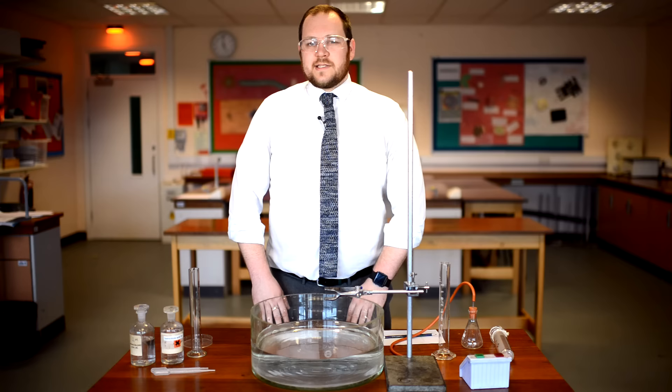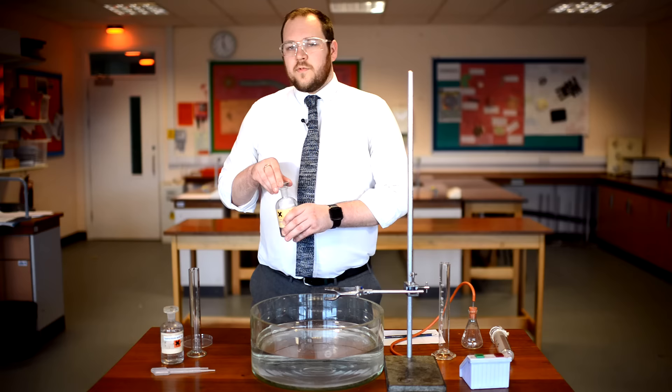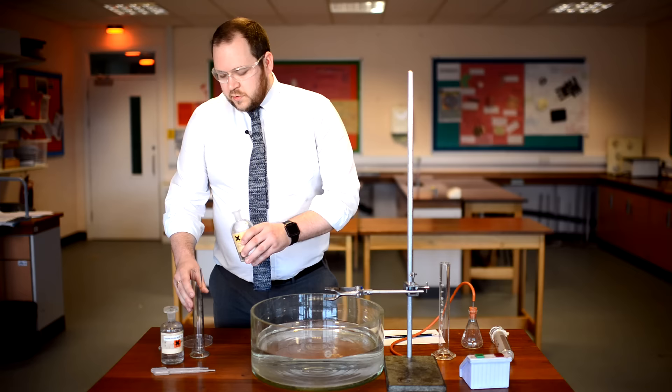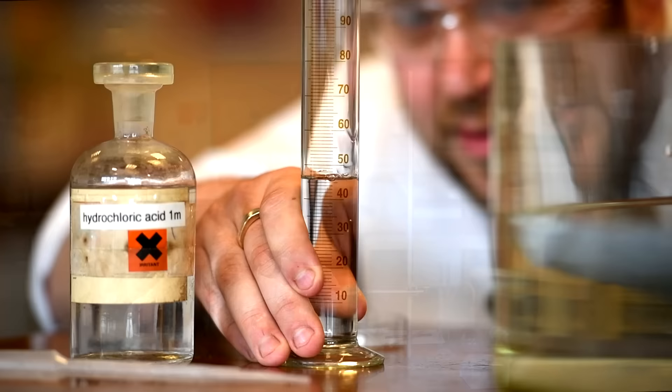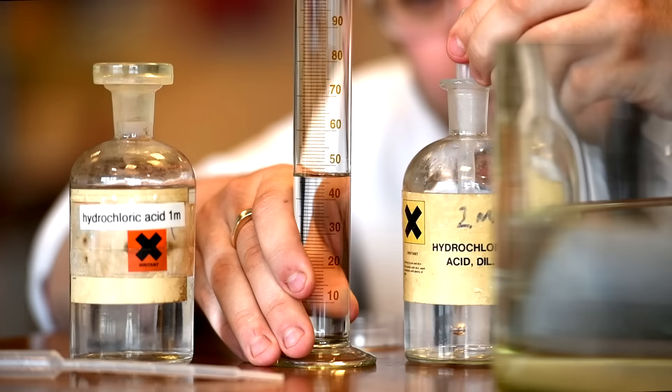I'm going to start by measuring 50 centimetres cubed of two mole per decimetre cubed hydrochloric acid in a measuring cylinder. I'm going to pour the first 45, making sure I read at eye level to see the bottom of the meniscus. As I get close, I'm going to use a pipette to add the final few drops.